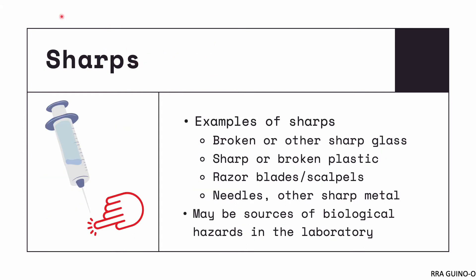Next, let's talk about sharps. Sharps are one of the most significant causes of biological hazards in the clinical laboratory. In fact, finger pricks or needle pricks are the most common injury encountered in the lab. Examples of sharps are broken or other sharp glass, sharp or broken plastic, razor blades or scalpels, needles, and other sharp metals.